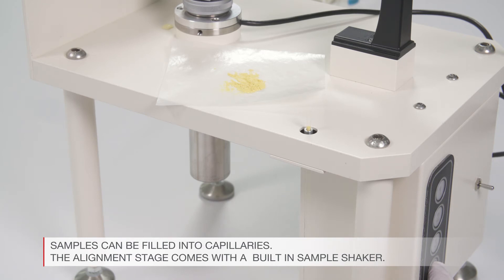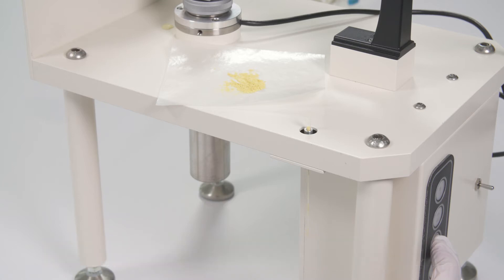Using the sample shaker, which is built in with a camera alignment stage, ensures easy filling and optimal packing of the sample.